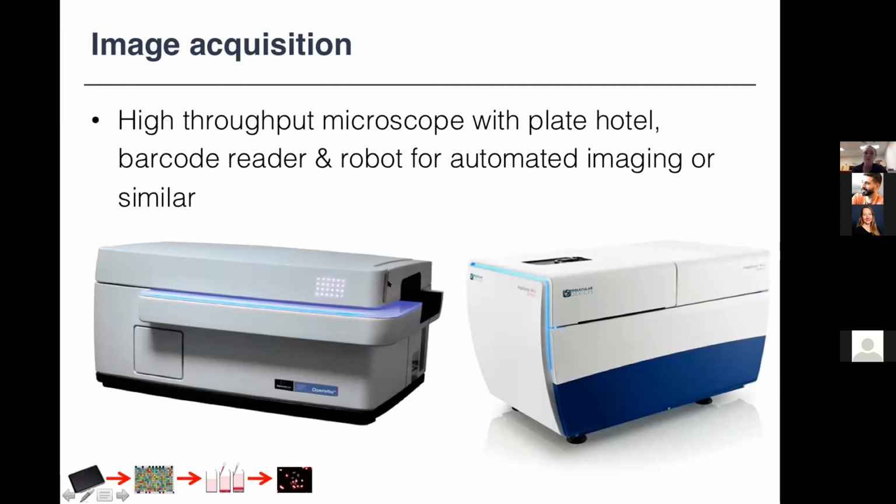So at least in our lab, we've used a couple of different microscopes. Historically, we used a PerkinElmer Operetta, and then more recently, we've moved this assay over to a Molecular Devices IXM-C system. Any high content, high throughput microscope is suitable for this kind of thing.